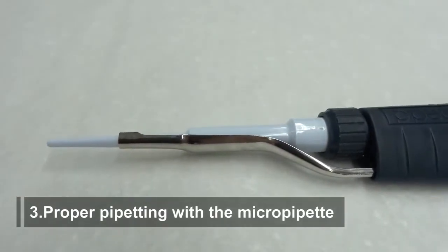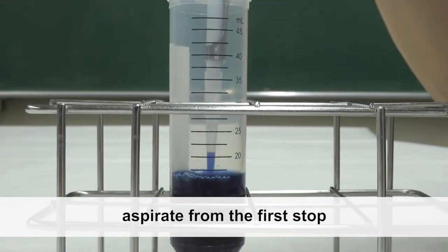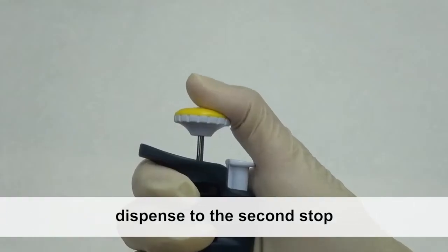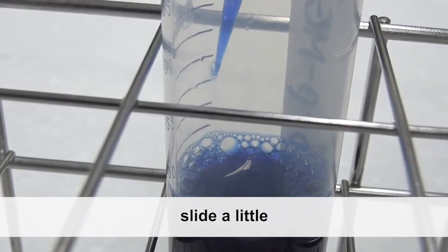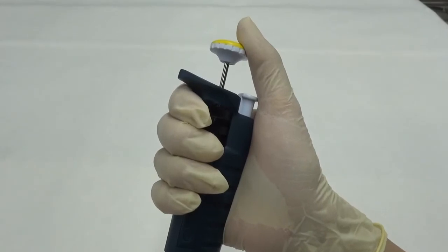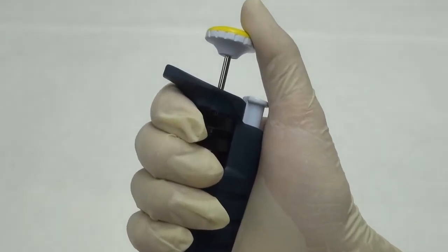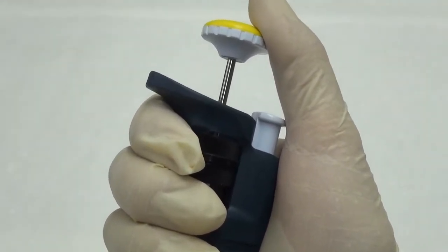Proper Pipetting with the MicroPipet. A Pithy Formula: Aspirate from the first stop, dispense to the second stop and slide a little. Now I will introduce the proper pipetting technique stepwise using the P200 as an example.